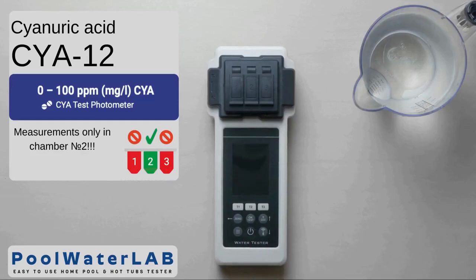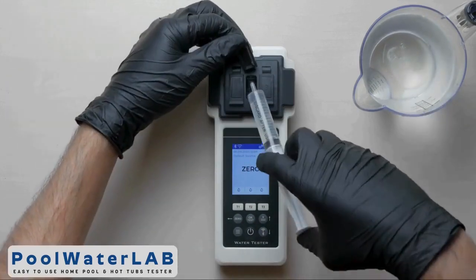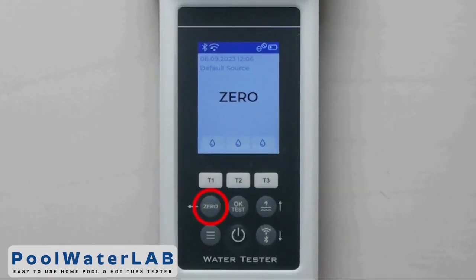Turn on the water tester using the power button. Add a water sample to all three measuring chambers with a special syringe, exactly 10 milliliters in each. Cover the camera with the light protection cap and press the zero button. Wait until the countdown ends.